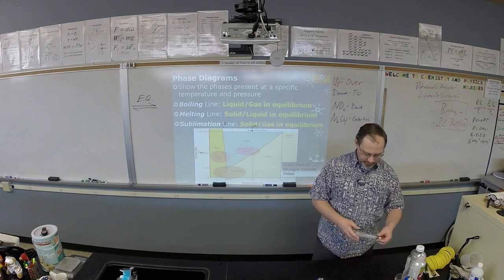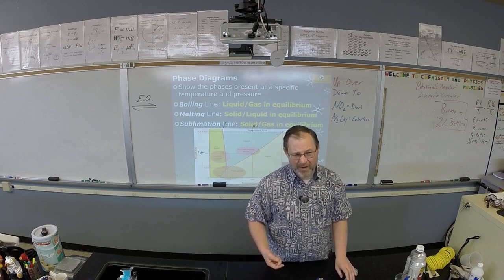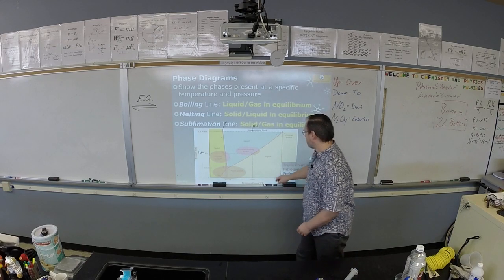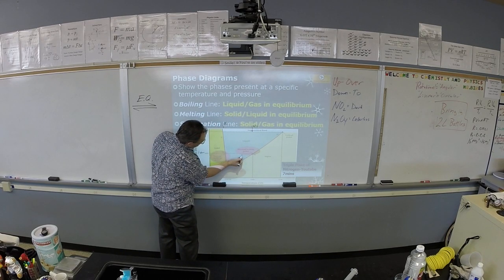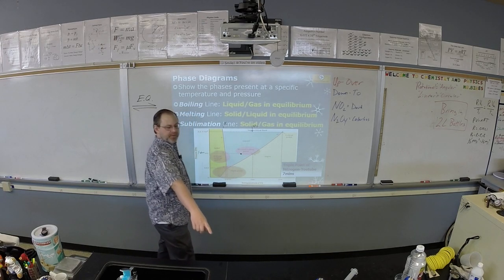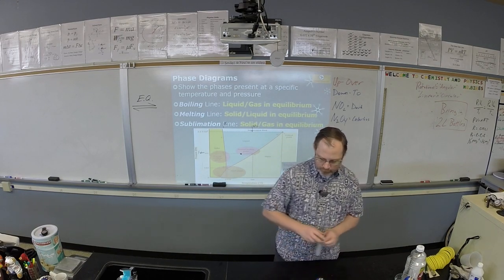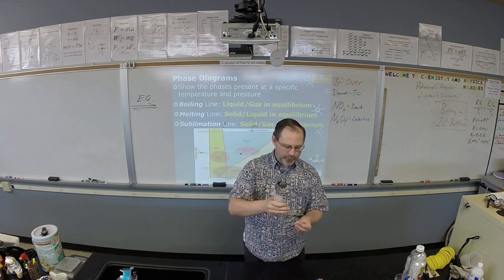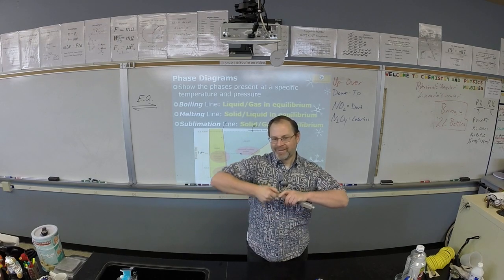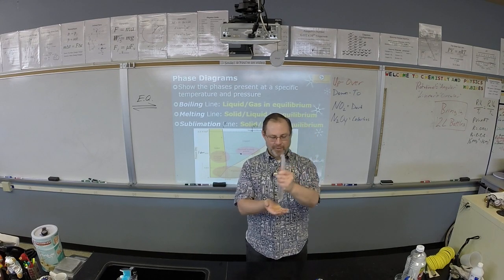Okay, so if you remember this, this water, when I keep my finger in it, is probably about 65 degrees, maybe 70 Celsius at best. So we're at atmospheric pressure, and the temperature is about 65. Right now, this compound here is what phase? Liquid. I'm going to suck some up. Still, what is it? Liquid. Then what am I going to do? Take the pressure away. Now what is it? It's boiling. Yay!